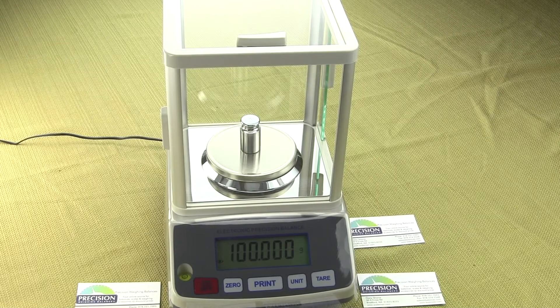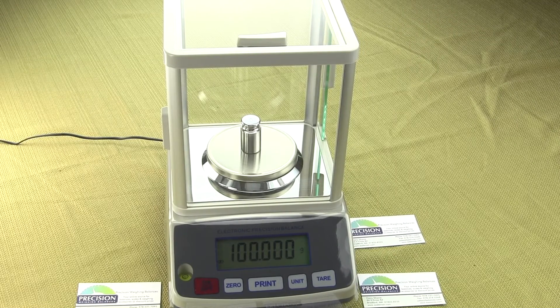In this video, we'll be demonstrating the electronic precision balance. This particular balance that we're showing is the EPB203. It has a weighing capacity of 200 grams by 0.001 gram, which is one milligram. This model is the EPB203.